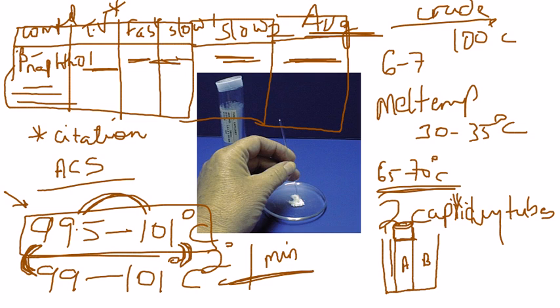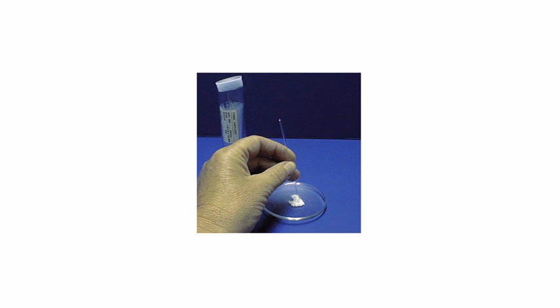No, you're going to take the average of the 2 lows and the 2 highs together and report that as a range still. You're not going to take an average and report like one single number, but rather still a range. Let me be very clear about that. If you don't do that, you are going to lose points in the way you are recording the data. So if you have any questions, feel free to ask me about that.